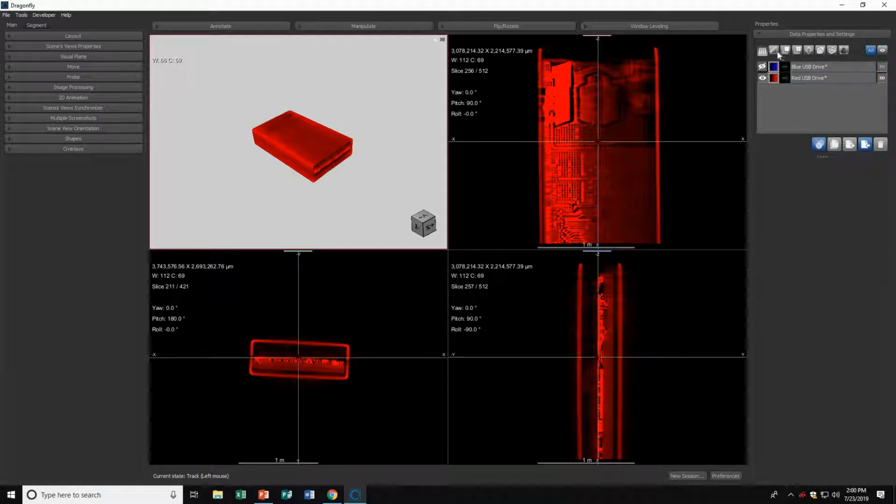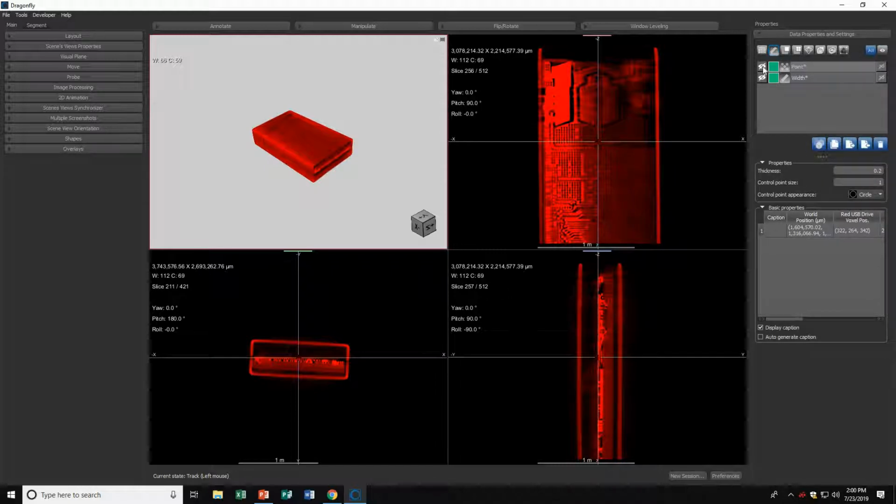The next filter is annotations, which is over here. We will learn more about annotations, but for now we can make them all visible and we can see how I use annotations to measure the width of the USB here, and I've chosen to point out a section over there. And again, I can make this only visible in 2D and not 3D.